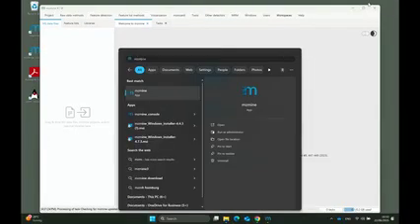Typically, when you install mzmine, it runs on all the different platforms. You can install it, but of course some people have restrictions on their laptops. We don't need any elevated rights, so you can also go with the portable version. Yes, you can also download mzmine that way.